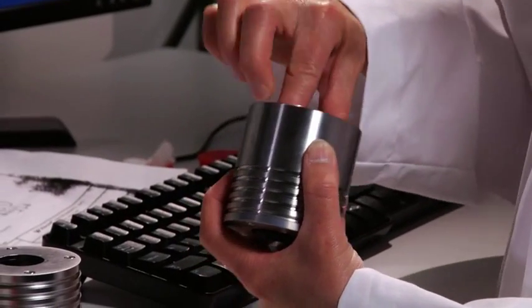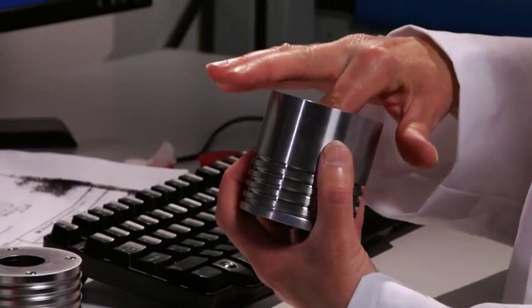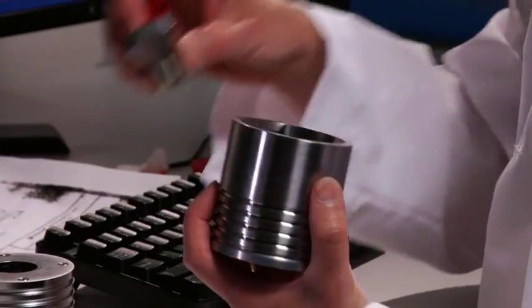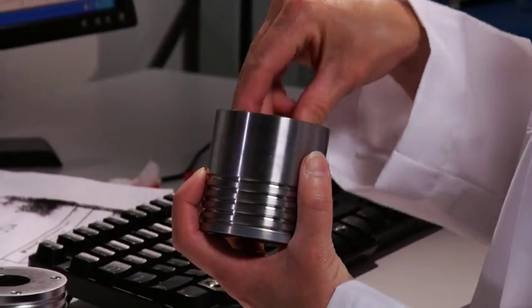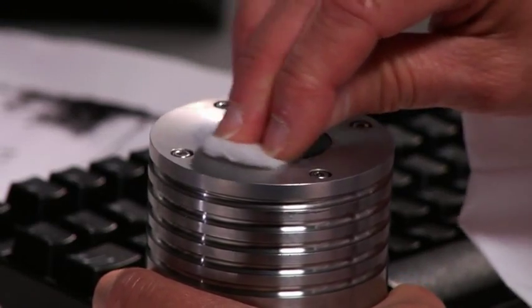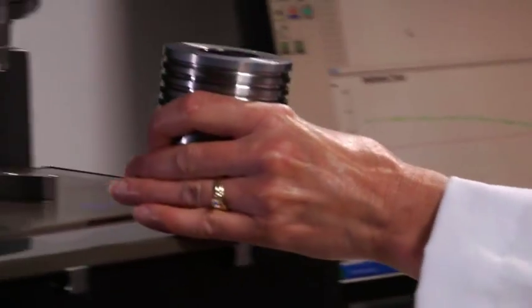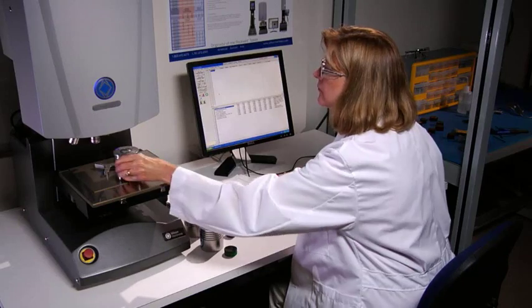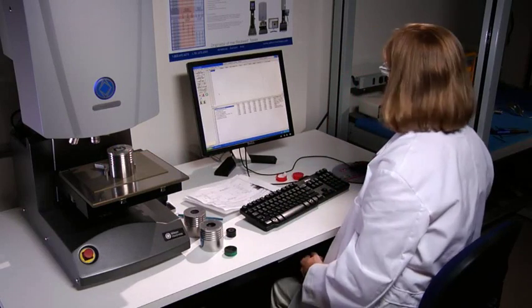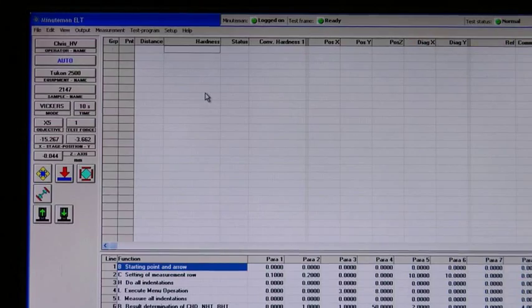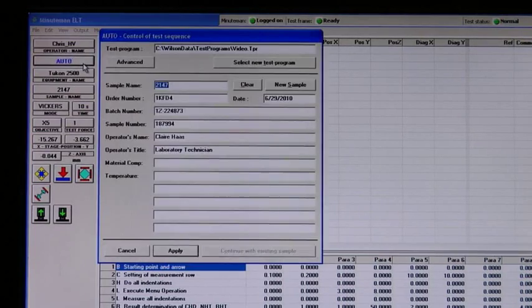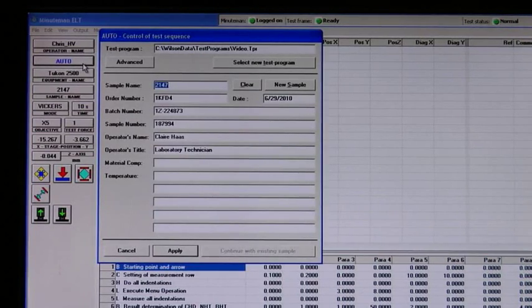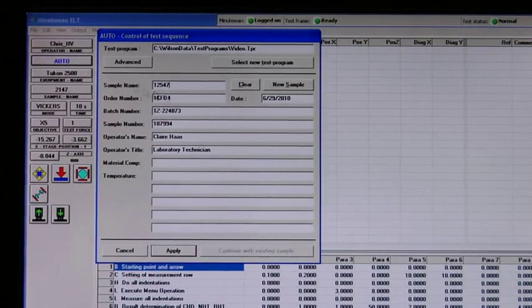The Toucan 2500 offers simplicity with easy sample mounting and quick test method development. Test setup is as simple as selecting a few test functions from a drop-down menu and keying in the necessary parameters. To run the test method, press the Auto button, enter your sample data, and press New Sample.